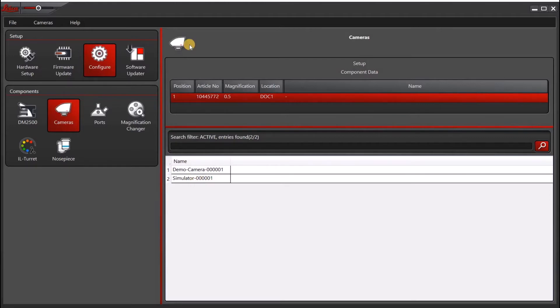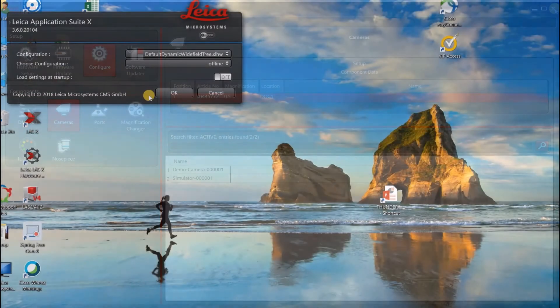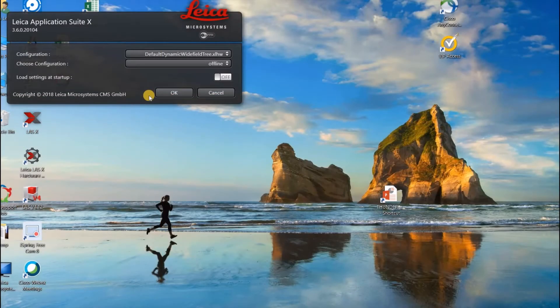Now you want to close LASX hardware configurator. The next thing you want to do is open LASX.